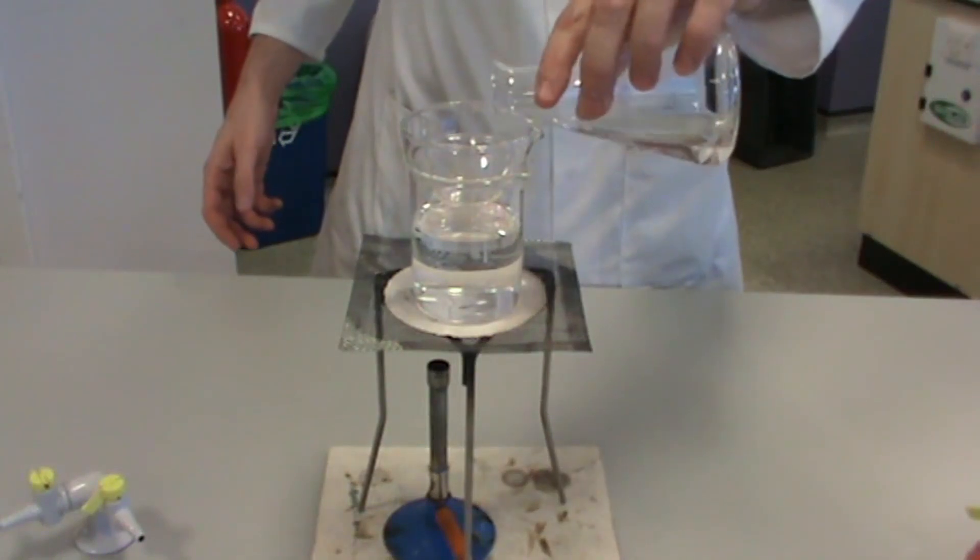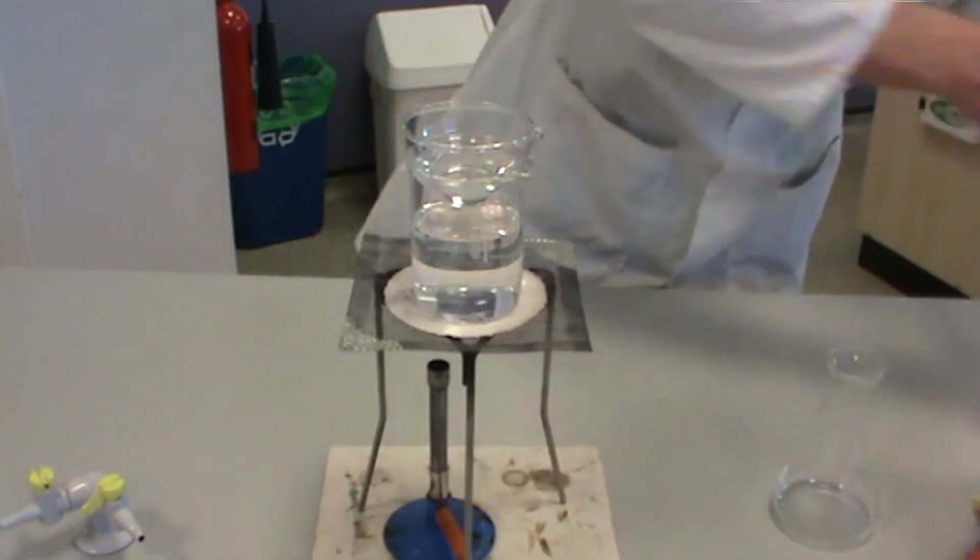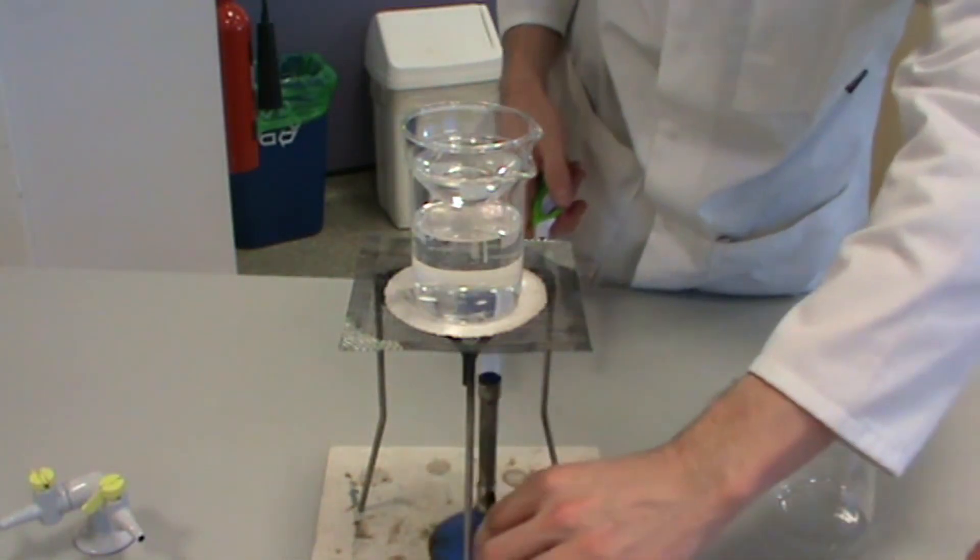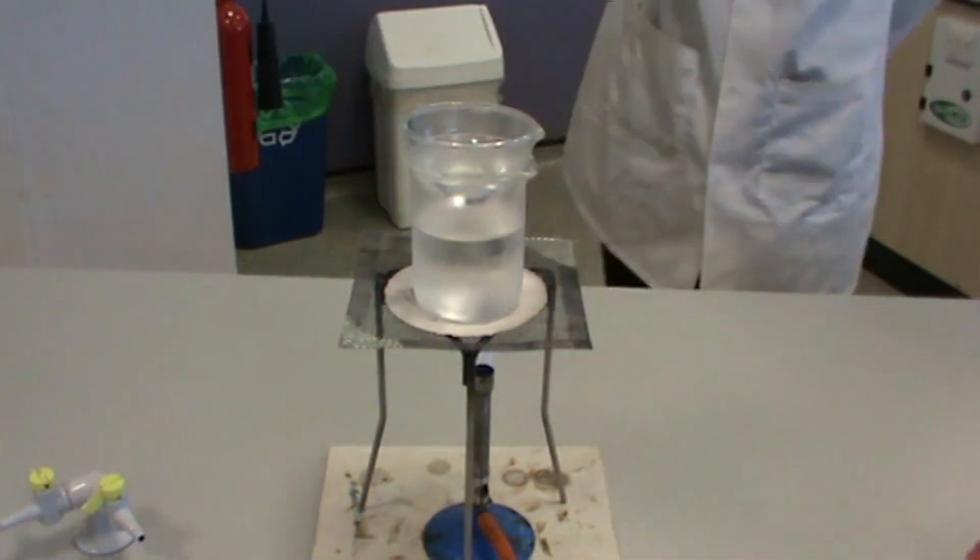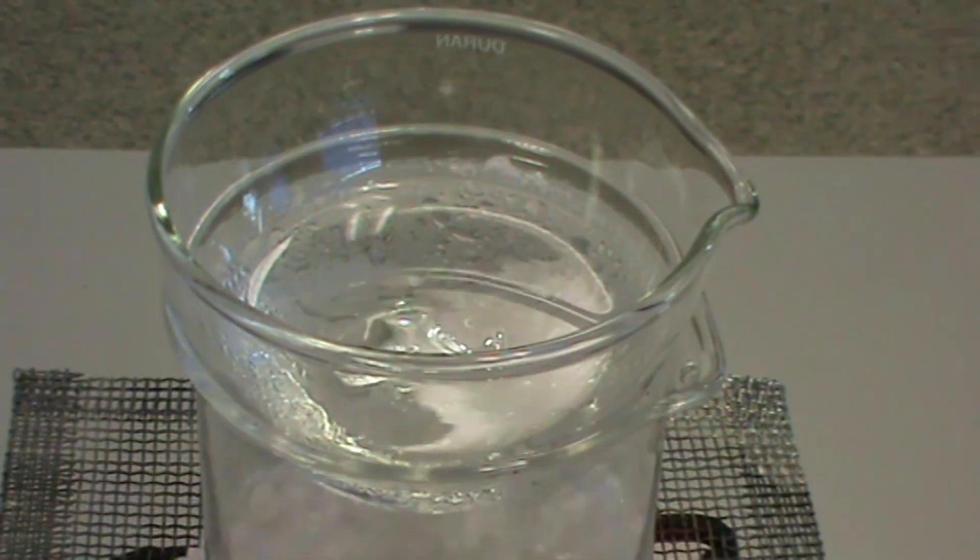Once we have created our sodium chloride solution, we need to obtain the sodium chloride crystals. The apparatus is set up as shown with an evaporating basin placed above a half full beaker of water. The sodium chloride solution is poured from the conical flask into the evaporating basin and then heated using a Bunsen burner on a roaring flame.